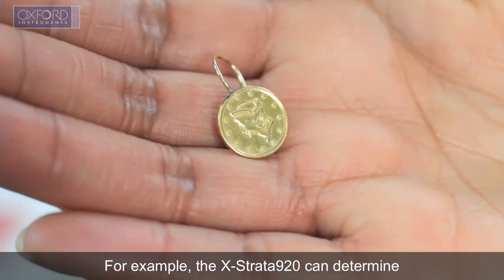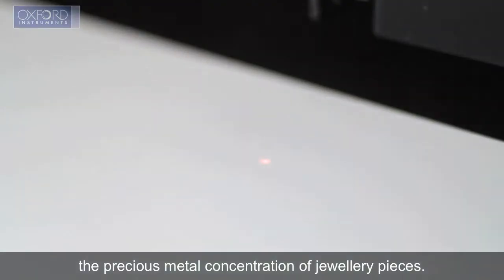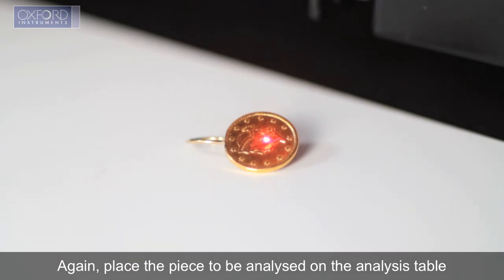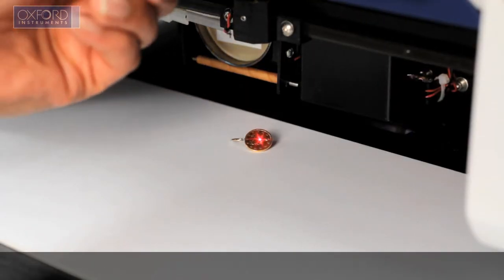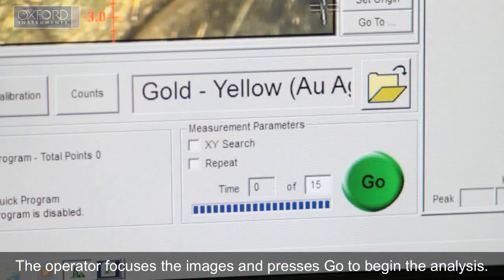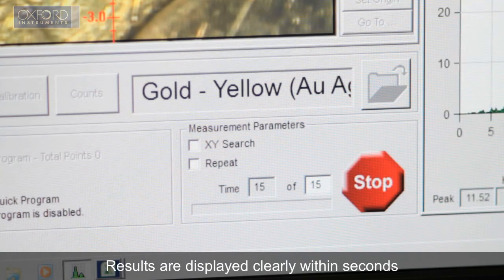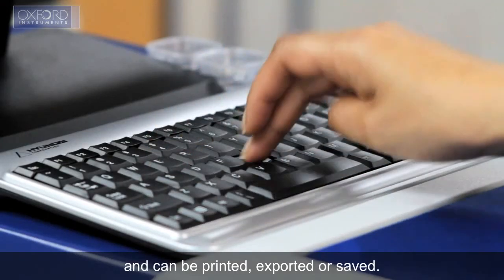For example, the Xstrata 920 can determine the precious metal concentration of jewelry pieces. Again, place the piece to be analyzed on the analysis table, roughly locating the first measurement point under the sample positioning laser. The operator focuses the image and presses go to begin the analysis. Results are displayed clearly within seconds and can be printed, exported or saved.